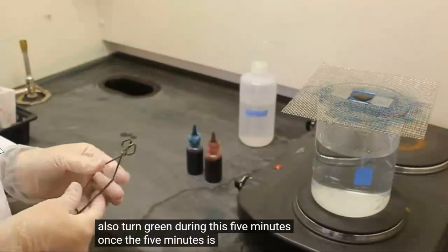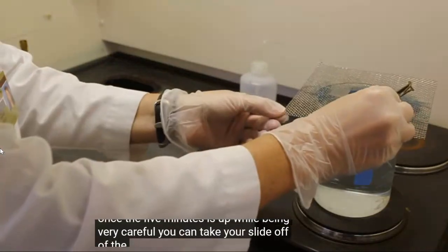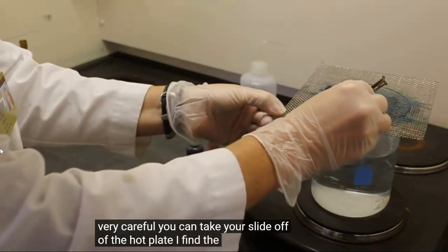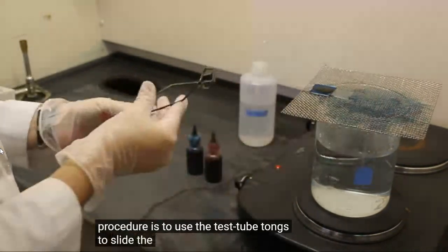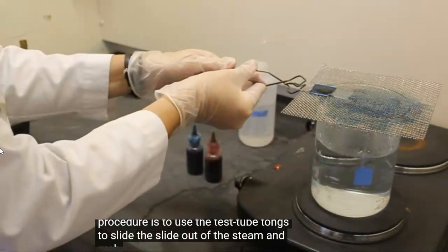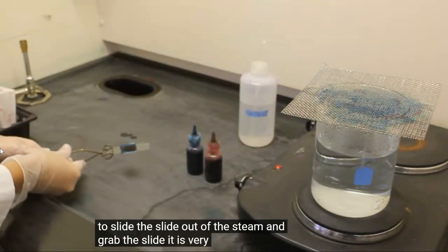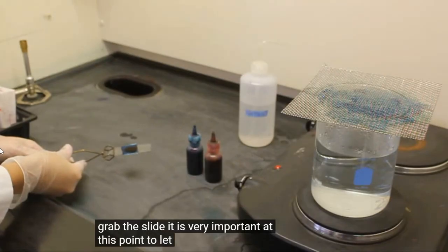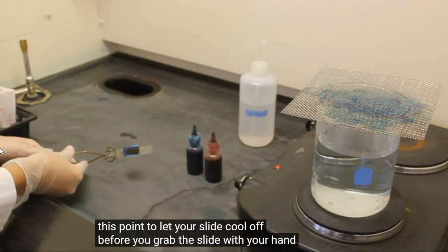Once the 5 minutes is up, while being very careful, you can take your slide off of a hot plate. I find the best procedure is to use the test tube tongs to slide the slide out of the steam and grab the slide. It is very important at this point to let your slide cool off before you grab the slide with your hand.